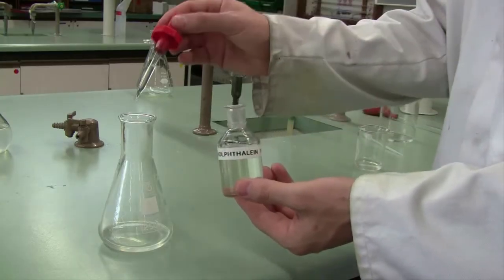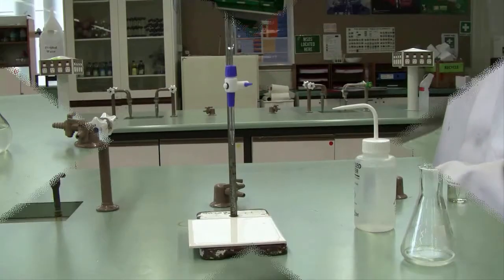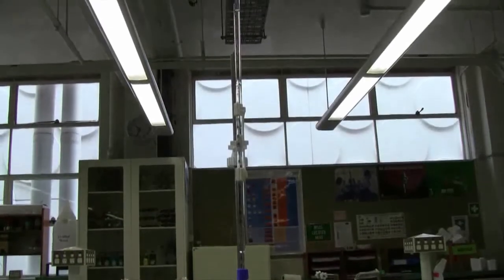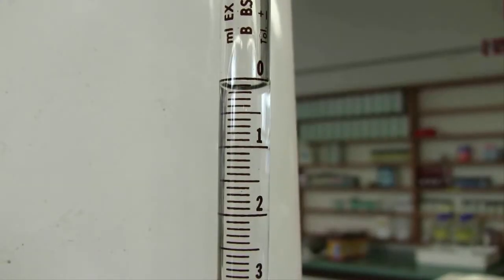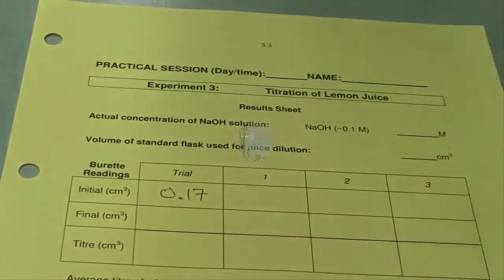Now we're ready to titrate. Fill your burette with approximately 0.1 molar sodium hydroxide. Make sure you remove the funnel from the top, make sure there are no air bubbles in the bottom, and then take your initial burette reading to two decimal places as best you can.